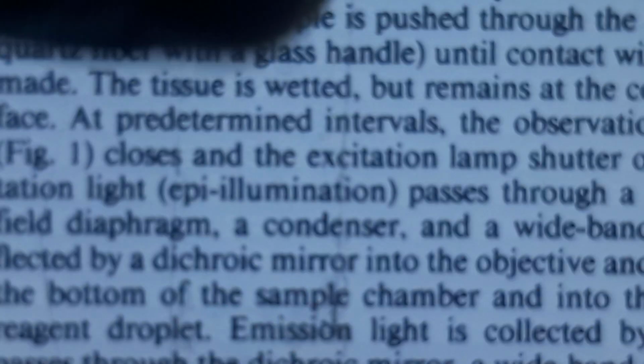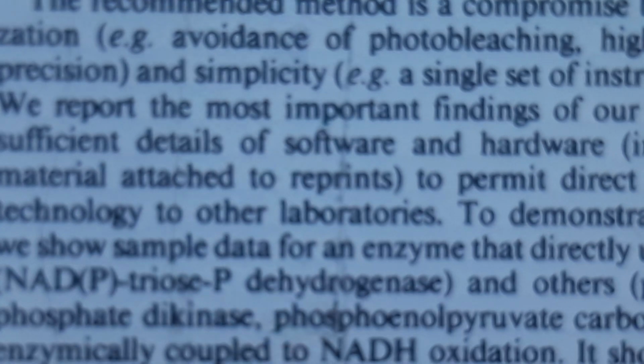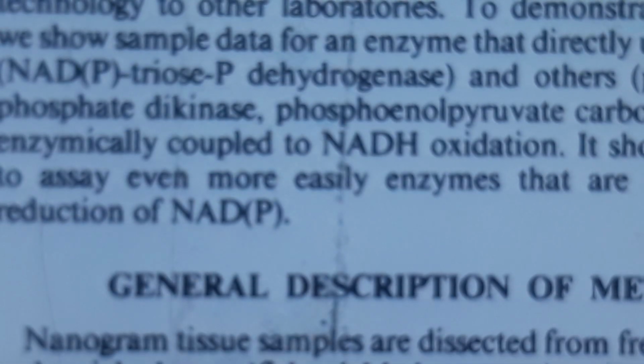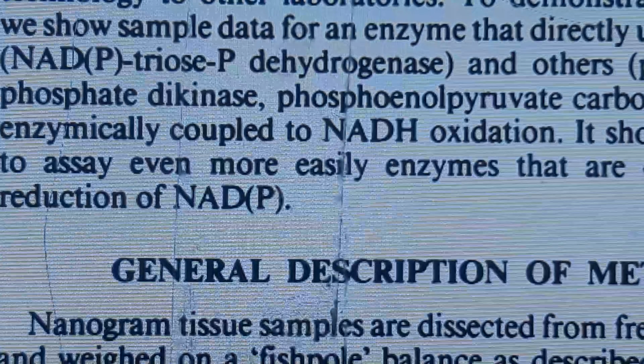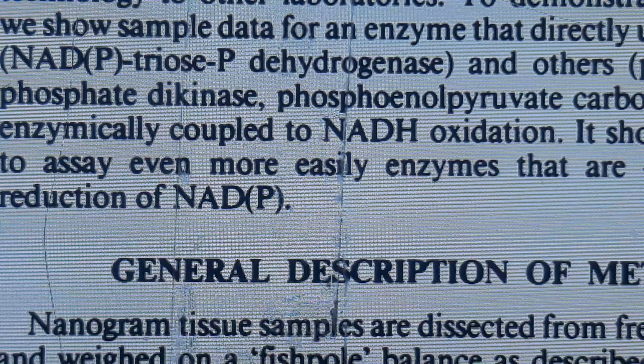The analog signal is processed by an electronic console, converted to digital and transferred via an input-output processor to a microcomputer. The signal is evaluated by a computer and the time course of the reaction is plotted in real time on the display. At the end of the experiment, a hard copy of the graphics and data is produced on the system printer. Other software can be used for consolidation of experiments and plotting.